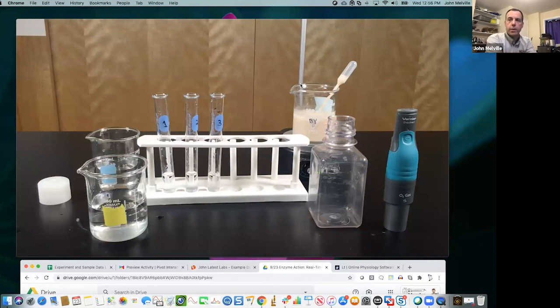The other thing I wanted to say is this entire activity can be done with a gas pressure sensor, the whole thing. Sarah and I and Colleen, who work at Vernier, the biologists, we tell a lot of biology teachers all the time, the best sensor to buy first is the gas pressure sensor, because you can use it for enzymes, for get a grip, and for transpiration. It's just a really good all-around sensor that does lots of things, and it's not that expensive.